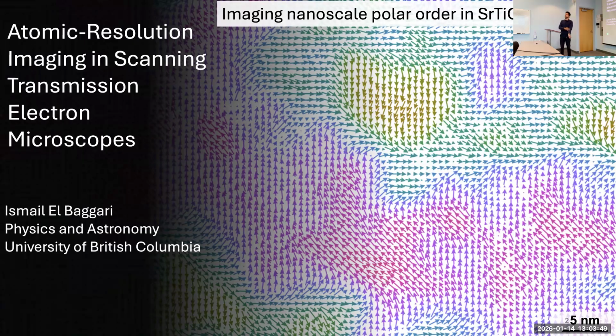I like to visualize order and disorder in quantum materials. This material here is strontium titanate. It's one of the most common substrates and materials used in condensed matter physics and quantum materials research. And I've spent the last few years developing cryogenic capabilities for the STEM because it turns out that it's quite difficult to get to cold temperatures without sacrificing resolution and stability. And we were able to visualize the emergent order and disorder at low temperature in a so-called quantum paraelectric phase in this material.